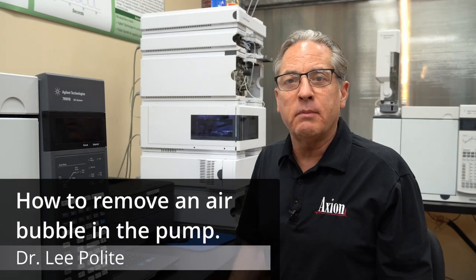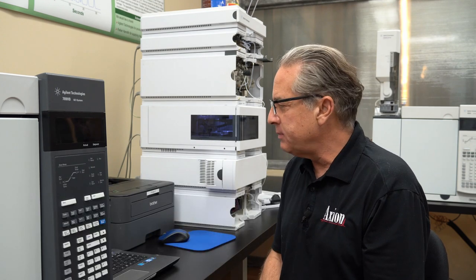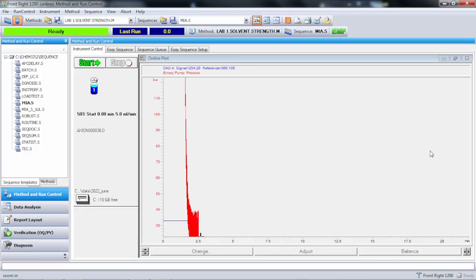So let me show you an example of the most common problem in HPLC, and that is an air bubble in the pump. By far the number one cause of problems in LC. And let me show you how we could tell what's going on.